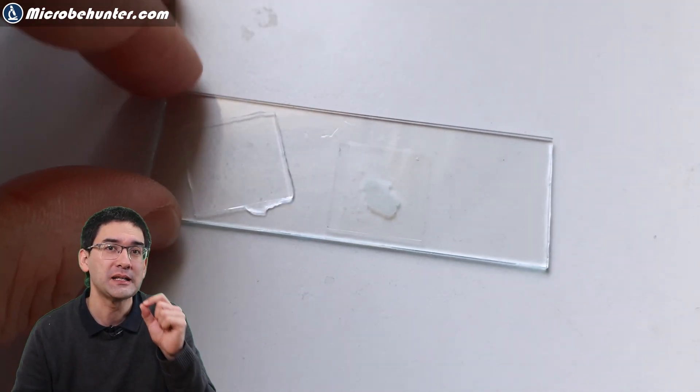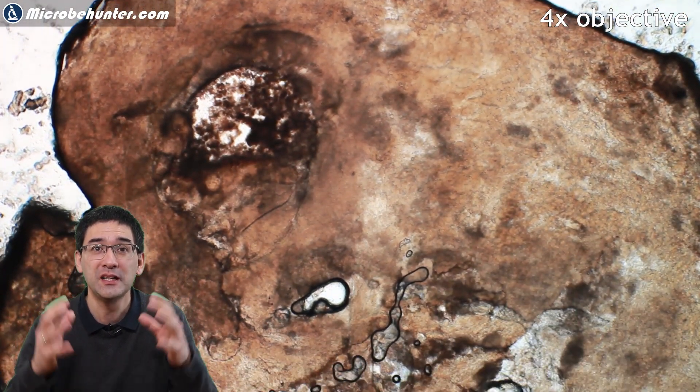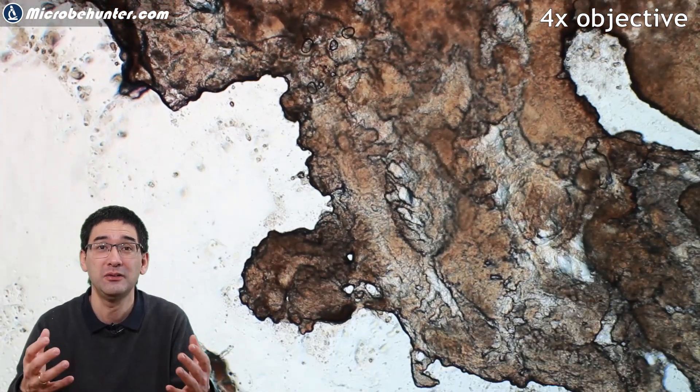Therefore, I've also taken some of the water, the liquid with some of the suspended bacteria, and put it under the microscope. This brown thing that you see there is essentially the kefir biofilm. And you see, it really doesn't look like anything. I could not see individual bacteria. The reason is because many of them were actually clustered together so densely that it was difficult to see the individual cells.